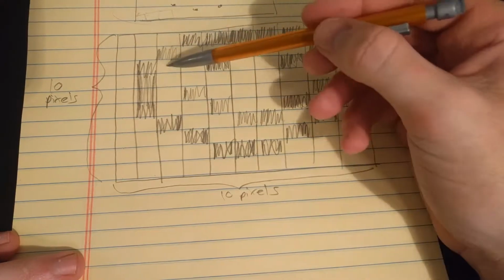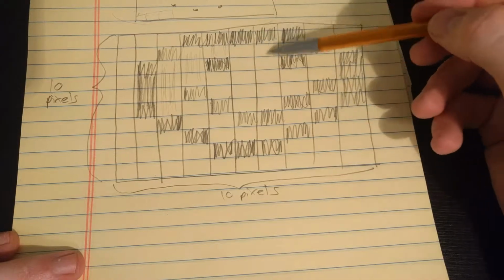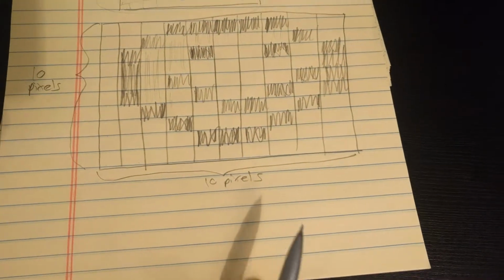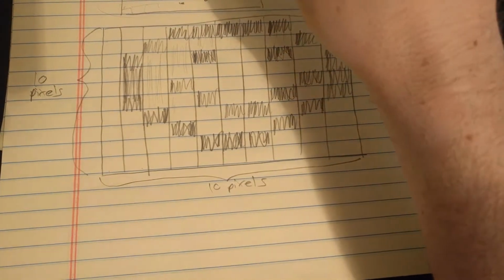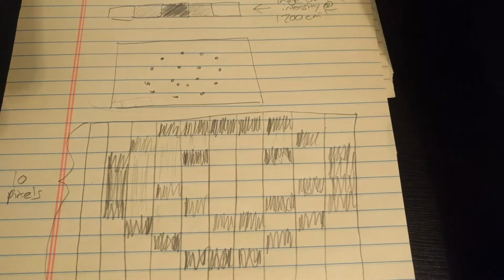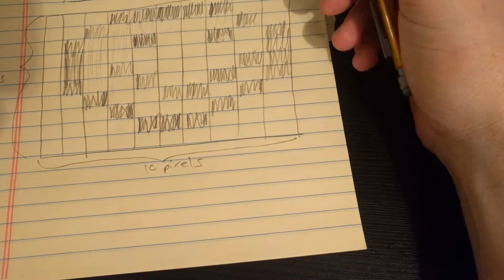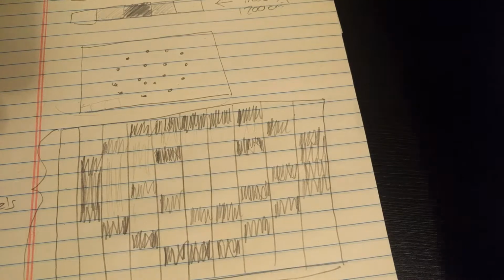And I really should have even shaded in these squares a little bit, because there might be some molecules around these molecules here, because it's not going to be perfectly sharp. But basically what this image tells us is how the molecules on the surface of the metal were formed. It tells us they were in the shape of a smiley face. So that's how Raman imaging can give us powerful information. It can tell us the spatial distribution of molecules on a substrate.